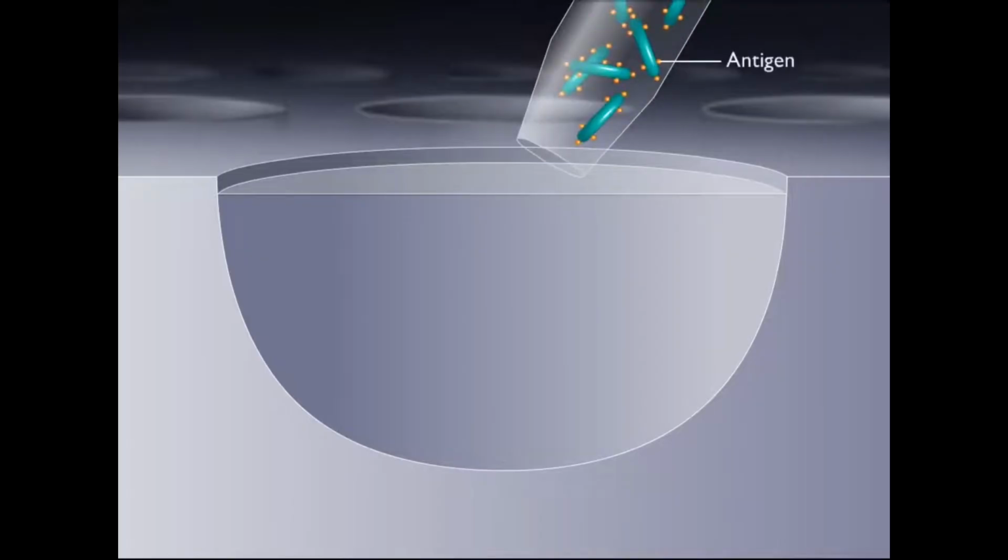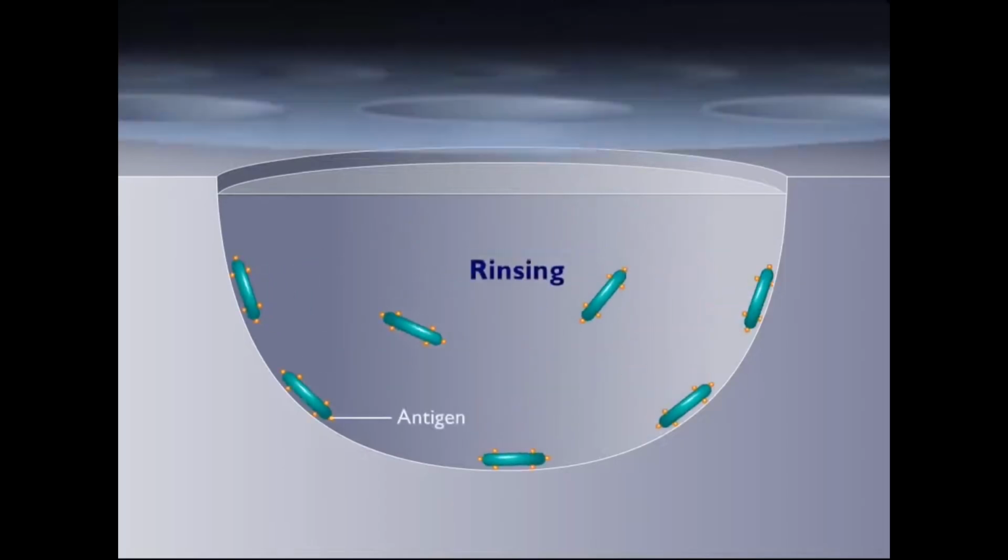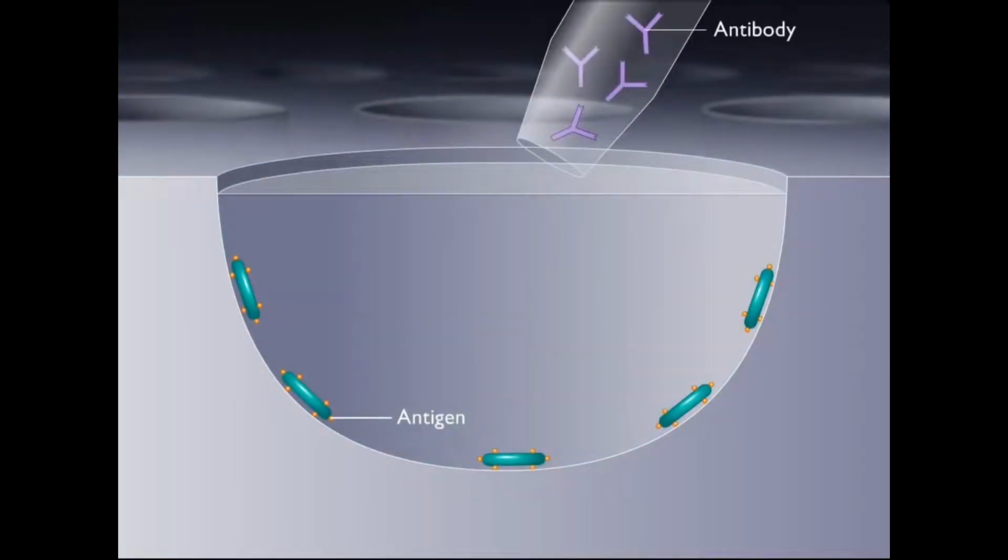So these are some of the kits I have just added to show that there are a lot of commercially available kits, like Invitrogen and Thermo Scientific, which develop ELISA kits. So you can just take it and plan your experiment accordingly.